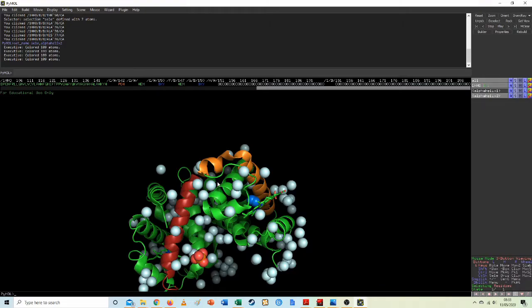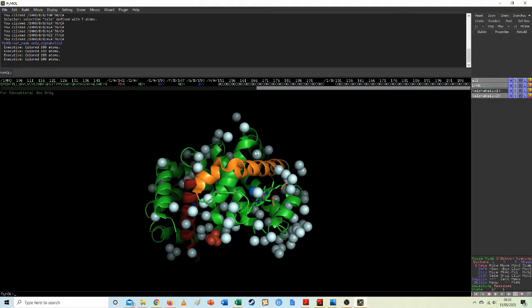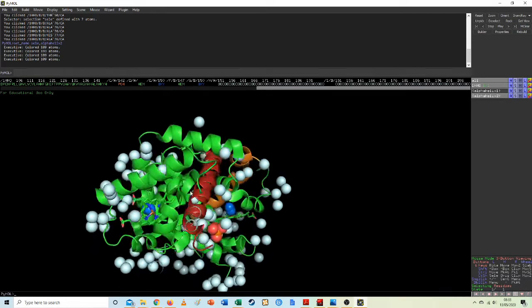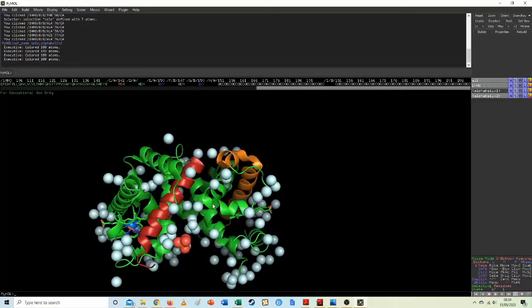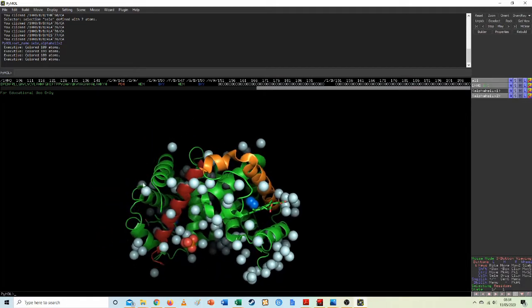If you wanted to find out what impact that little bit had, what you could do is mutate your DNA strand so you alter the amino acid sequences, so the residues here are different, and that may not take up the same shape as it does, and you could see if the protein is more or less effective at its job. Right, so those are our alpha helixes. I will be giving you a proper note in the next lesson about these. However, I think it was nice for us to be able to show them like this.